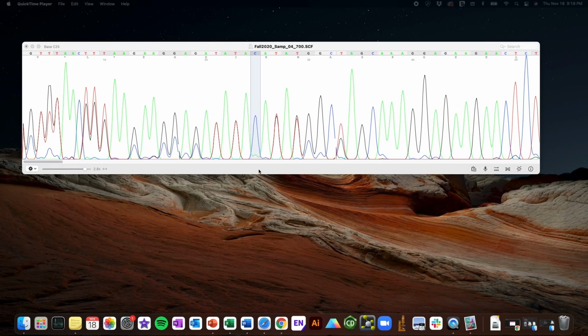One thing you are going to have to do with your data after you found out what the gene that you sequenced is, is find the amino acid sequence in your data. The amino acids are denoted by the little gray letters that are right below the nucleic acid sequence. And one thing you are going to need to try to do is manipulate the frame shift of it. That's going to be right down here, and you can click on frame +1, +2, or +3.